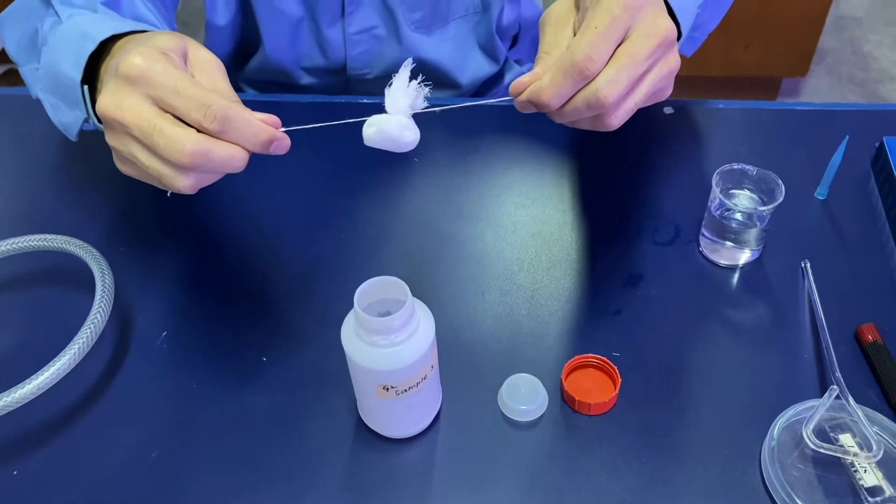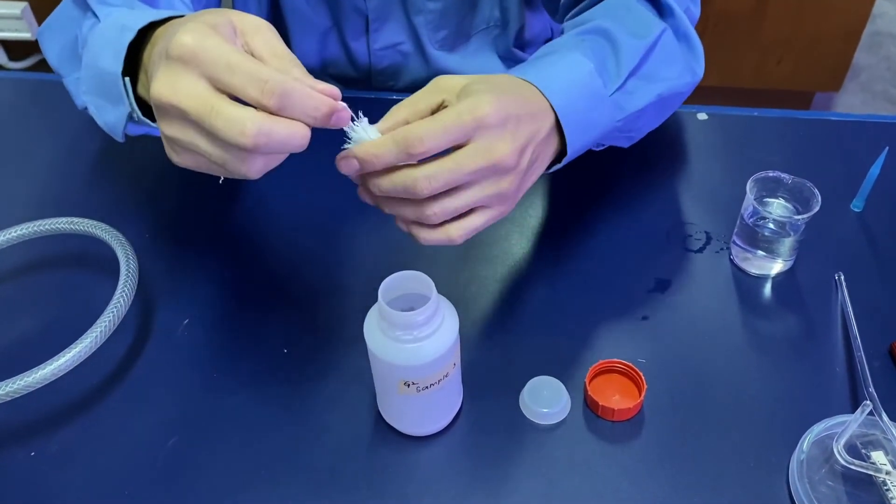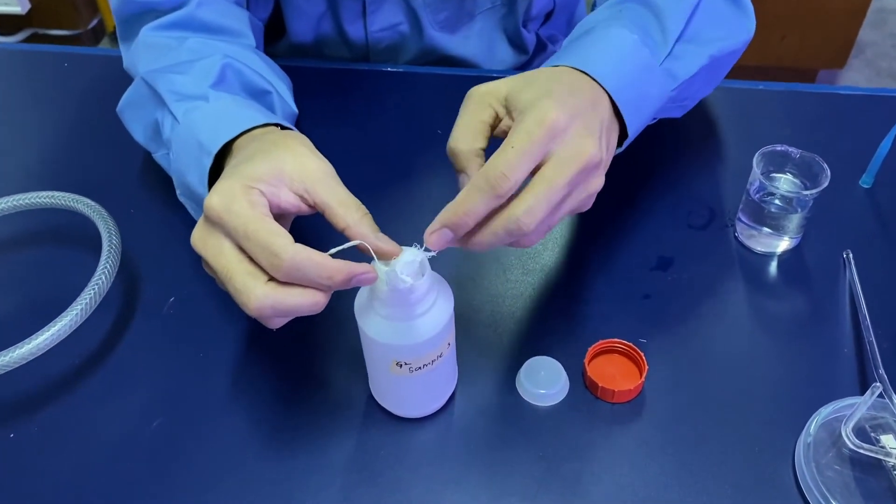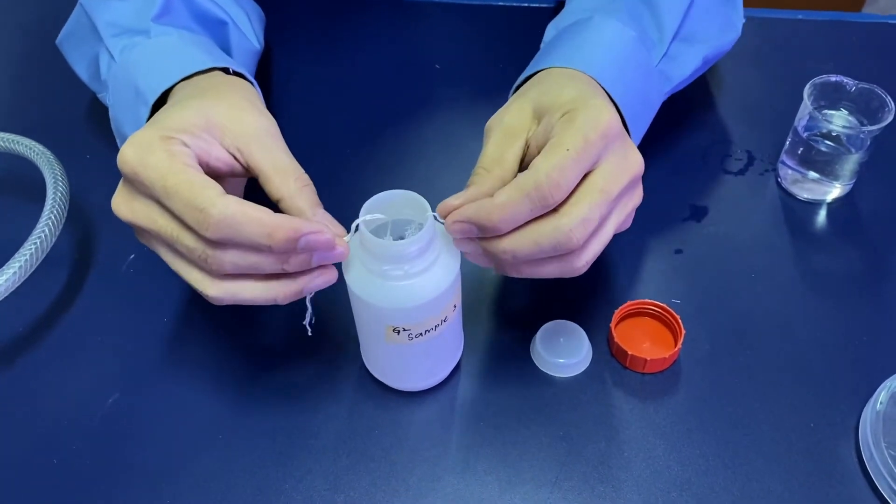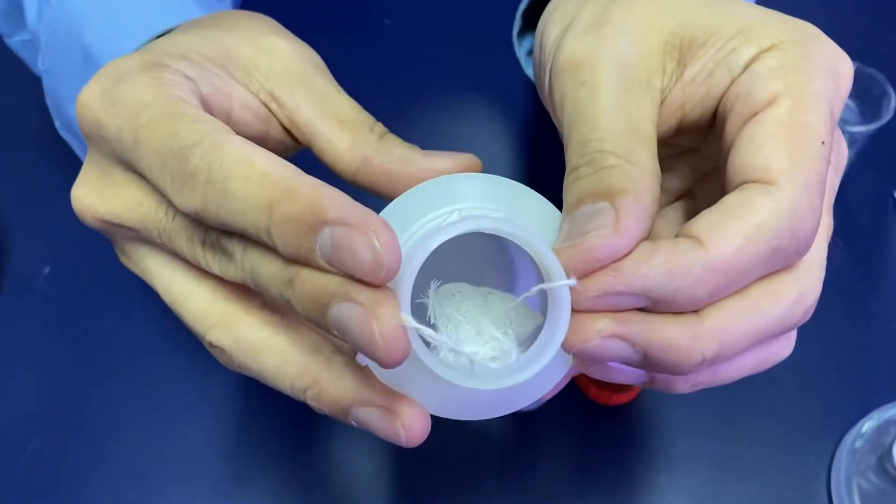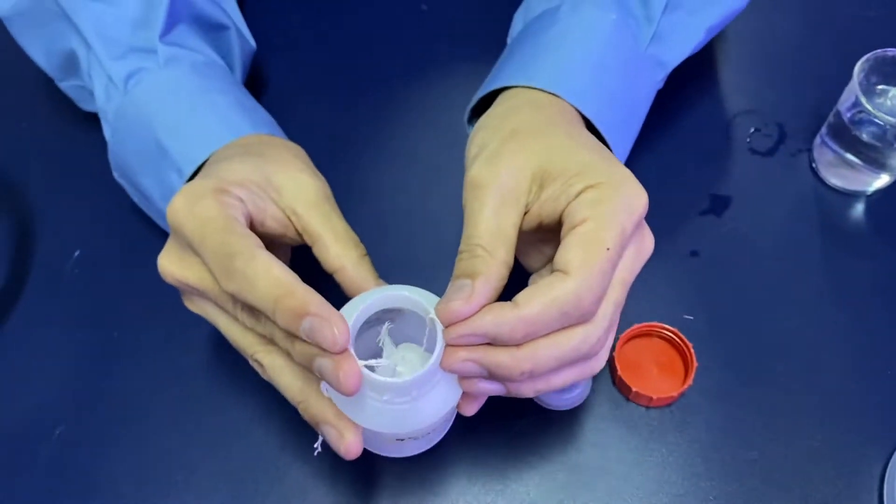Once it's tight, place the bag of soil carefully hanging in mid-air in the bottle so that it doesn't touch the solution at the bottom.